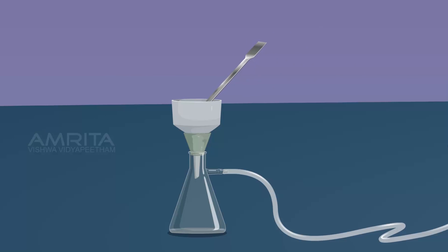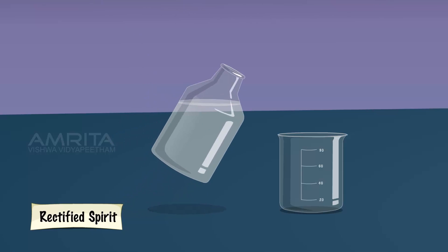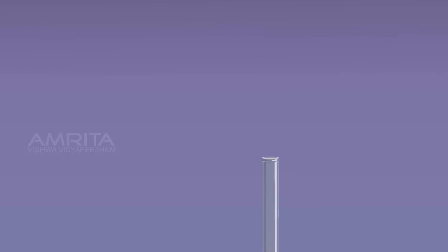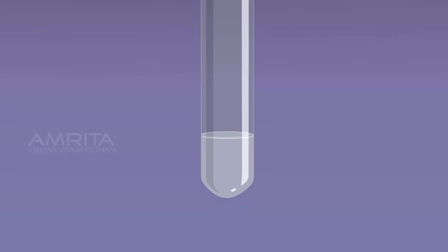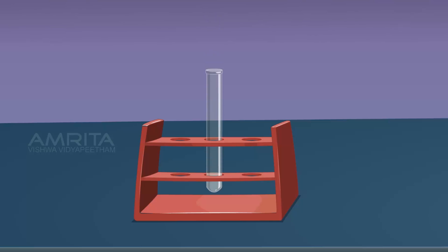Take the precipitate of Dibenzal Acetone using a spatula and transfer it into a test tube. Take some rectified spirit in a beaker and heat it. Add a little of this to the test tube containing the precipitate. The precipitate dissolves. Then allow it to cool slowly. On cooling, pale yellow crystals of Dibenzal Acetone separate out.